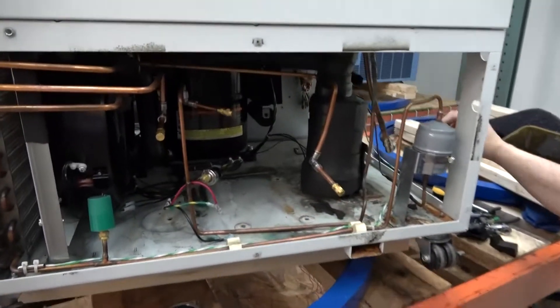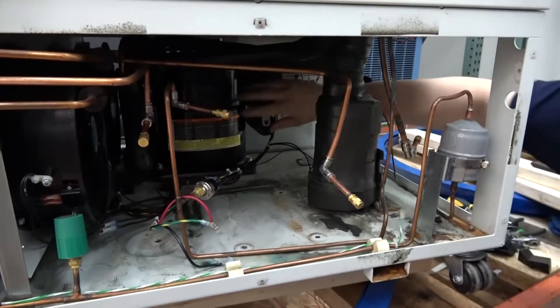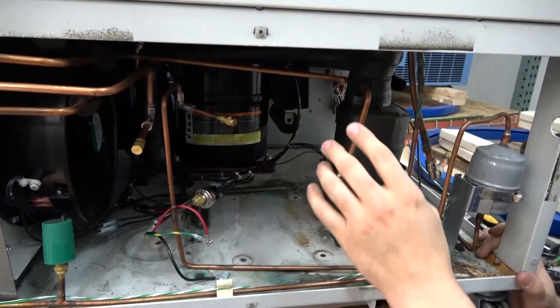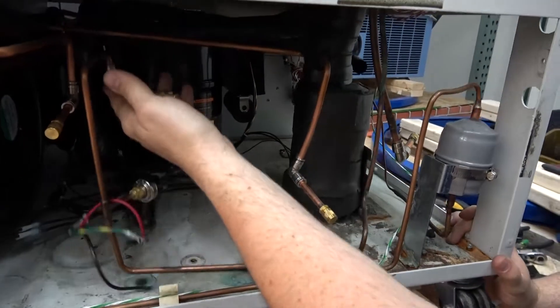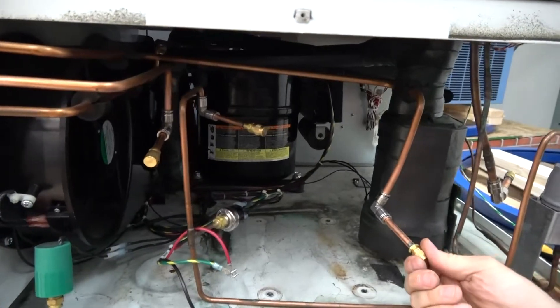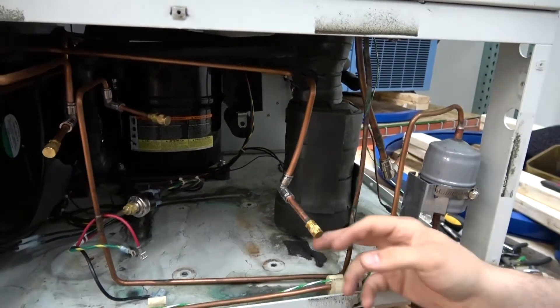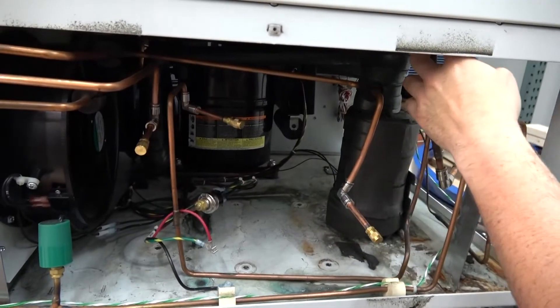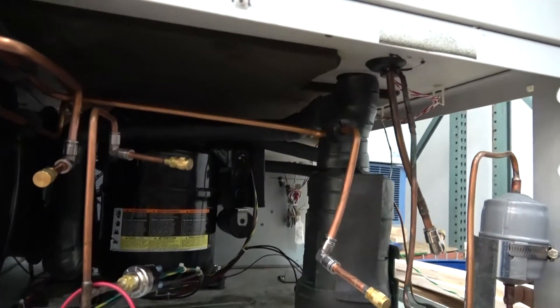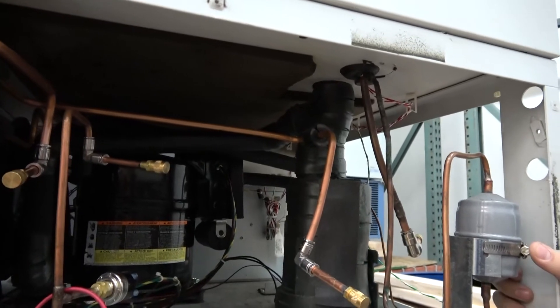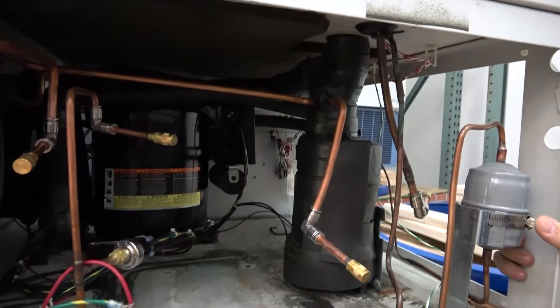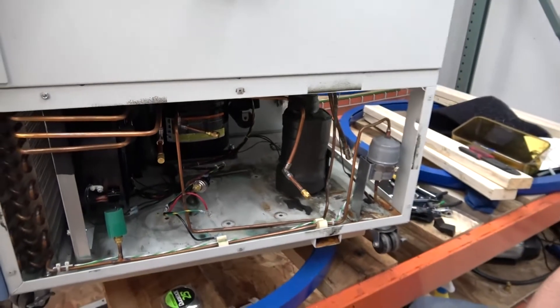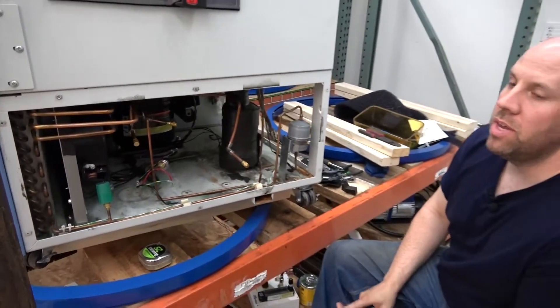And once we do that, we're left with something like this. All the components are out. This is first stage, this is first stage, that's first stage. So all the second stage components are out. And what we do is we tap into the lines with quick connects and we flush all the lines that are left in the freezer with alcohol.